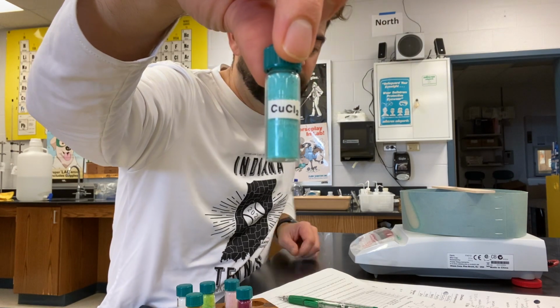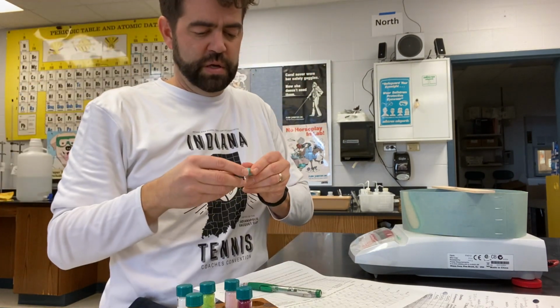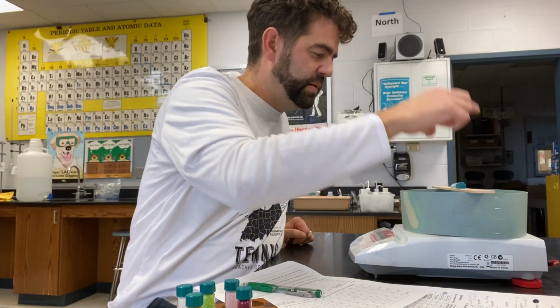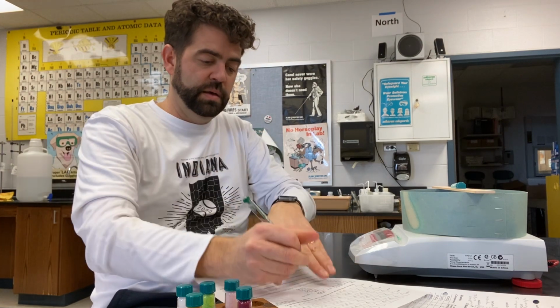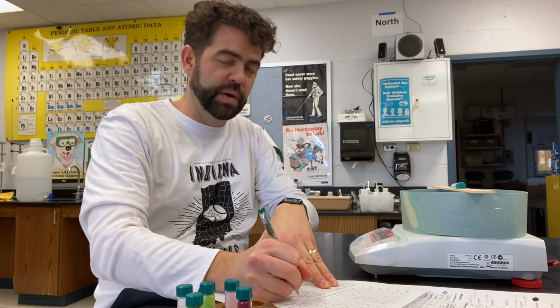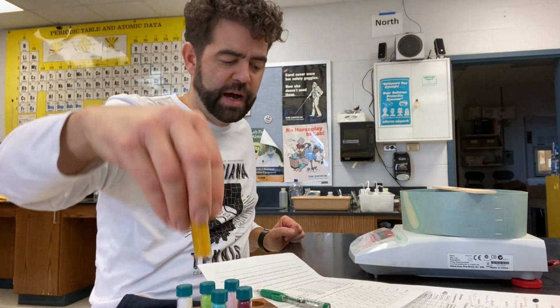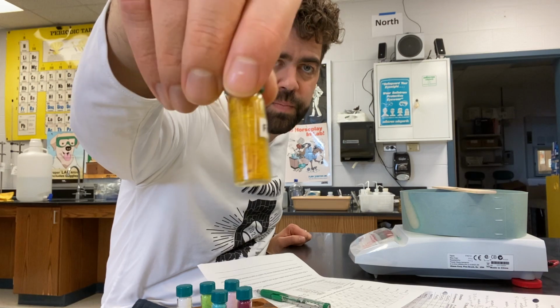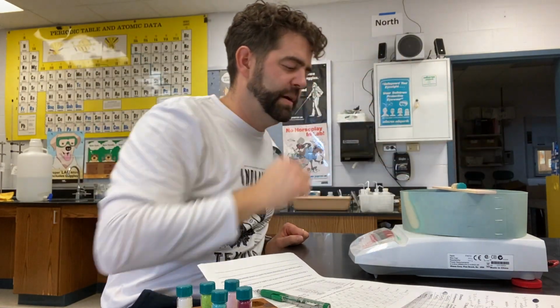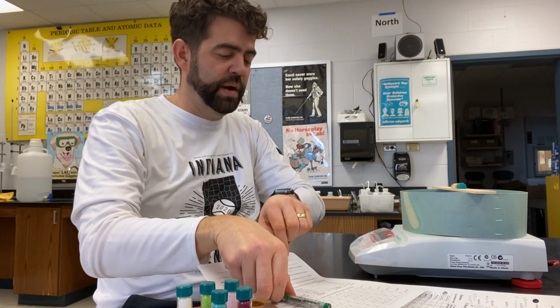Let's do the next one, copper. I would say probably more of a light blue color there. CuCl2, put that there. And that's barely anything at all. 0.06, all right? Next one, iron. Iron's kind of a cool color there, yellow. I put that right there. Hands off, 0.32.